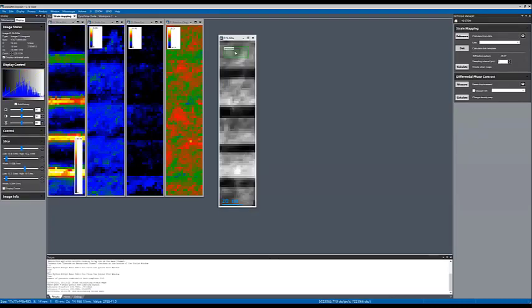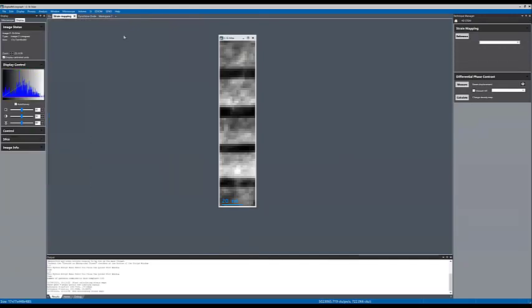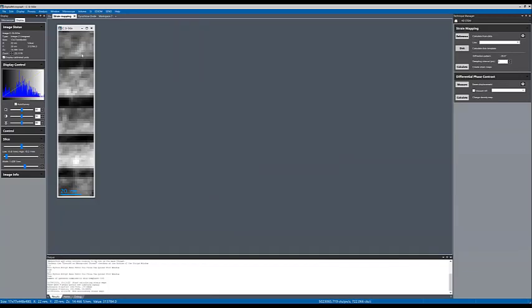Like Anna mentioned. But typically for that type of sample, like nice crystalline samples, like a semiconductor, for example, you will probably find a substrate or something that you can use as your reference lattice.